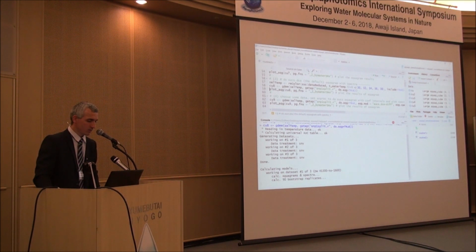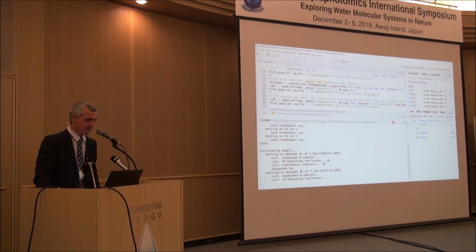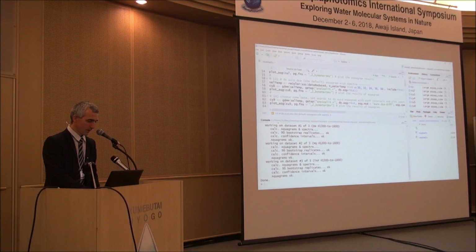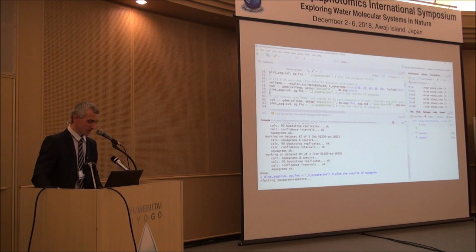And for that we use bootstrapping, which might take some time on your computer. It basically is parallelized, but due to platform problems we switched it off for now, just for those who are interested. Okay, and again, so the results are calculated, we need just to plot them.